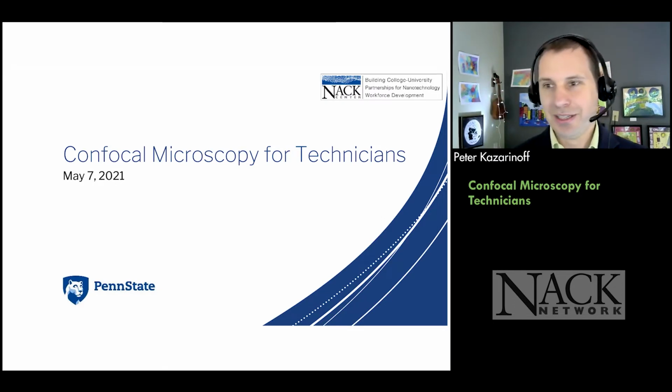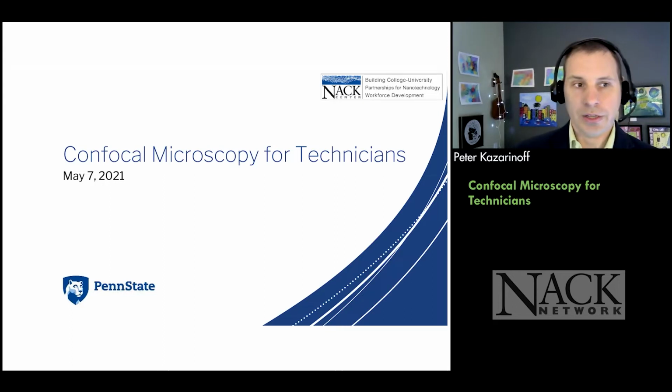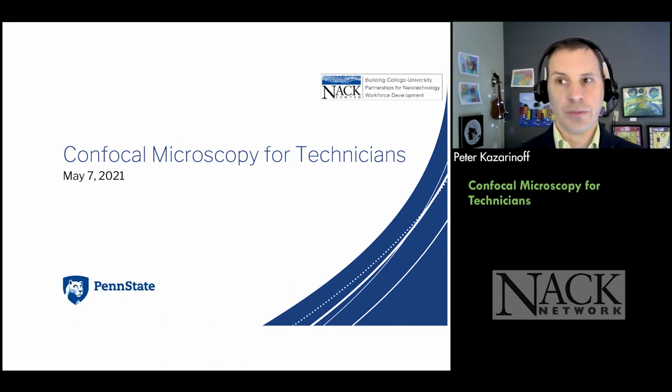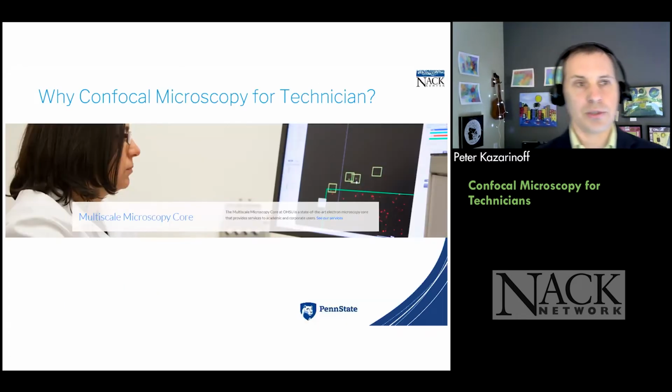So I'm going to try to be fairly brief here. I'm going to talk about confocal microscopy for technicians. Fatma's presentation was on confocal microscopy for research, and I'm going to talk about how we taught technicians to use confocal microscopes.